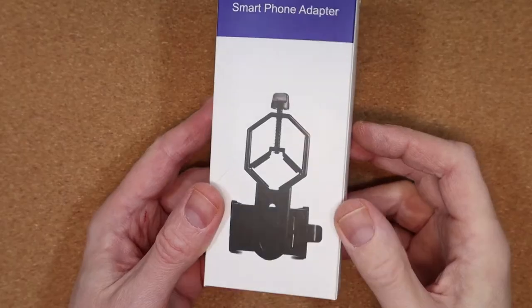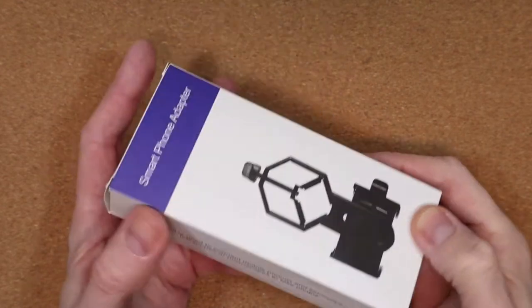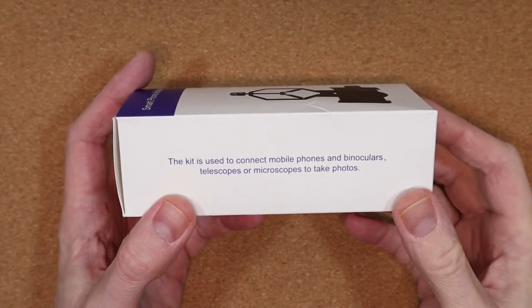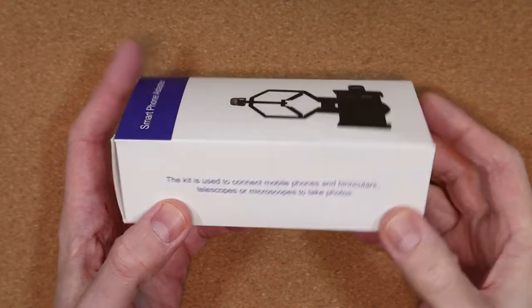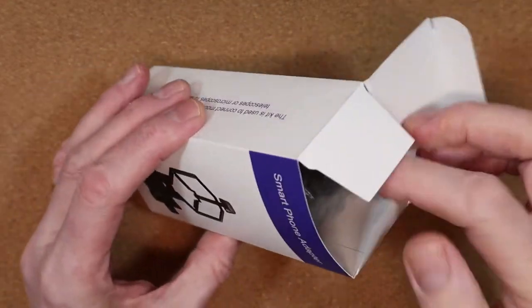That led me to this thing here, a smartphone adapter which allows you, as it says in the box, to connect mobile phones to binoculars, telescopes and microscopes, to take photos and of course video too.